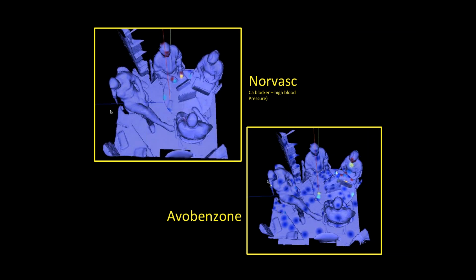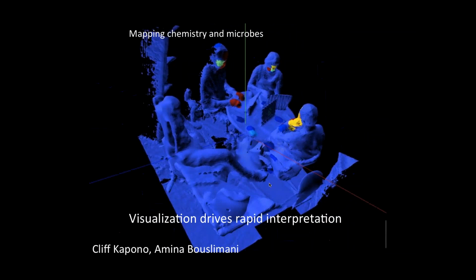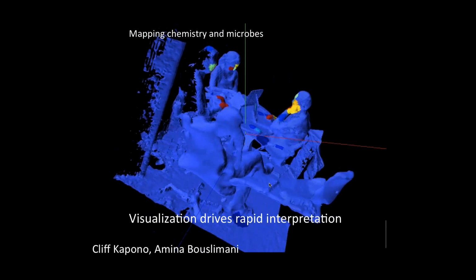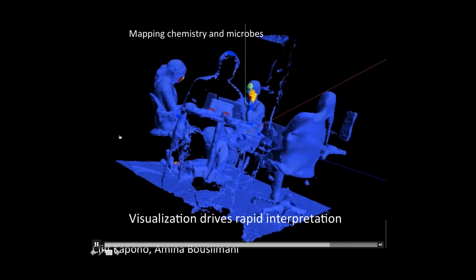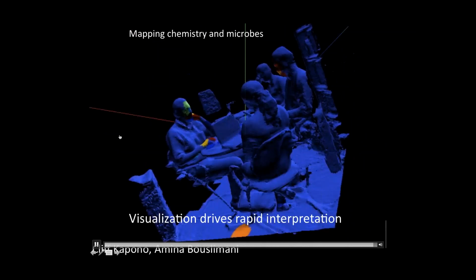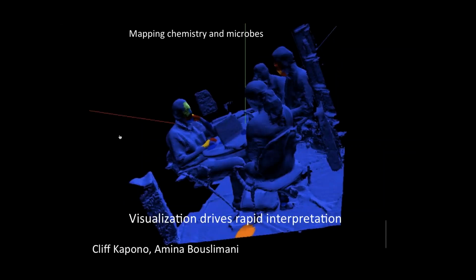But the key message to take home is that visualization really drives rapid interpretation. So if you look at this particular office image that's rotating, you can see a signal on 4 people, and you can see a little bit on the floor there. Now, if you look at the one person, happens to be me, I don't have any of that signal on me. And it turns out that the signal is caffeine, and I don't drink caffeine, but the other 2, particularly the 2 males that are sitting adjacent to me, they drink a lot of coffee. And then I figured out, well, somebody spilled coffee in my office because we can see it on the floor. And so very quickly we're able to interpret what might be happening in this particular context.